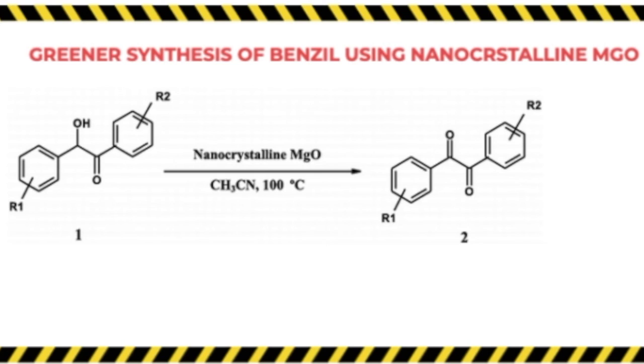Here in this case, we have the alternative to use those nano MgO crystals, which are more selective, produce less waste, and allow the reaction to occur in less time, making it a more suitable reaction for scientists and students to do in the lab. However, it's a little bit more challenging for students to do in the lab because it takes a little more finesse to use the nanocrystals compared to the nitric acid. But overall, this reaction is much more safe for the environment and is much better at getting a higher yield of a crude product. So thank you for your time.